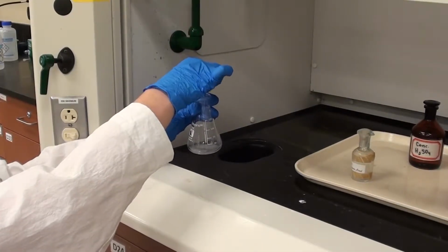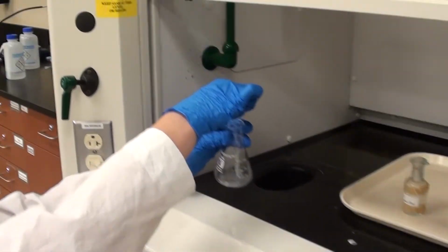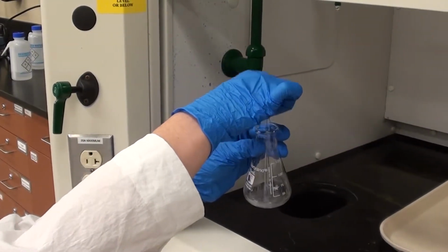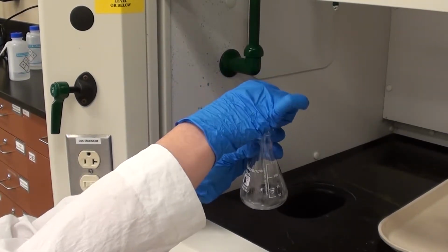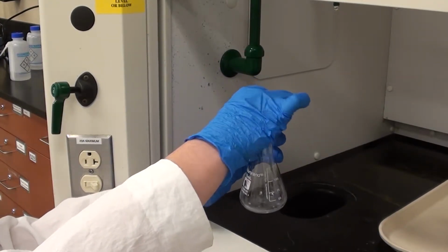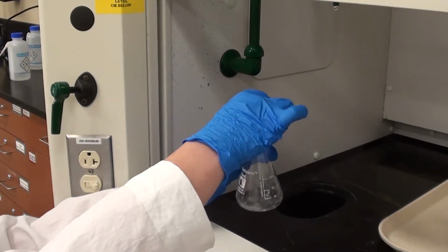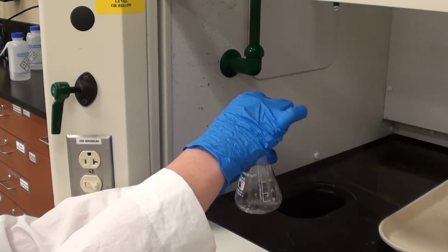So Cassie's been stirring this for a couple of minutes. You can see that the solution has become a lot more clear. It's a little bit cloudy still. There are some boiling stones in there, but the boiling stones came from the salicylic acid itself during the recrystallization process. Those weren't removed during crystallization. But those aren't really affecting anything. So you'll notice that this solution is almost pretty much completely clear. She's going to keep on stirring it.